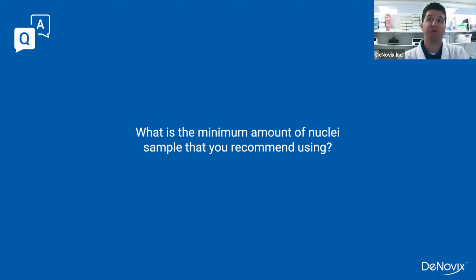Mix them together for a total of 5 microliters to load into the 50 micron height. Again, I mentioned earlier, in practice, it would be a little better to account for pipetting error and probably do 3 microliters and 3 microliters. But you can get away with as little as 2.5 and 2.5 if you're really careful about your pipetting, to minimize how much of your actual extraction you need to use.